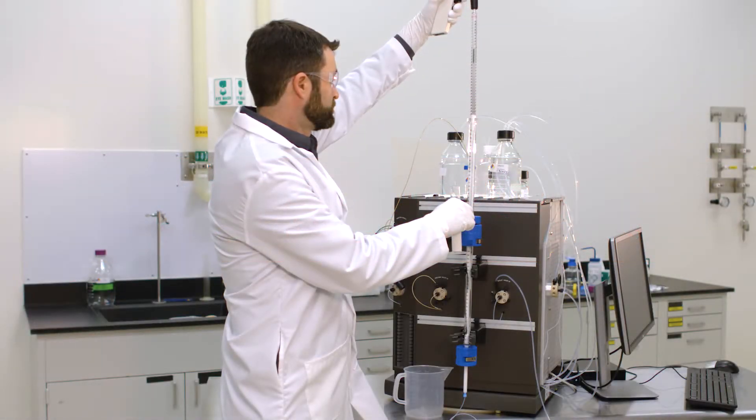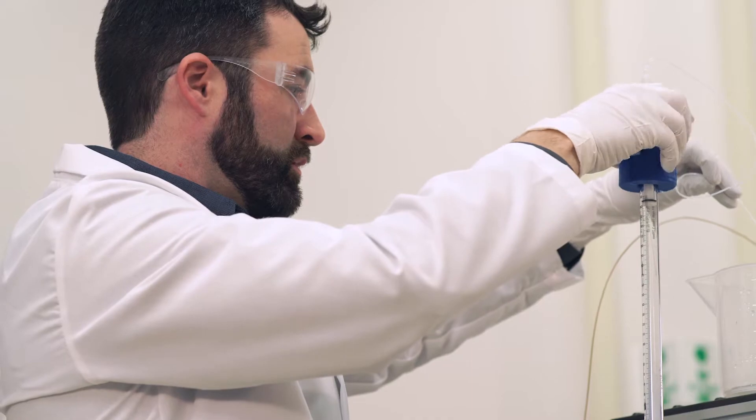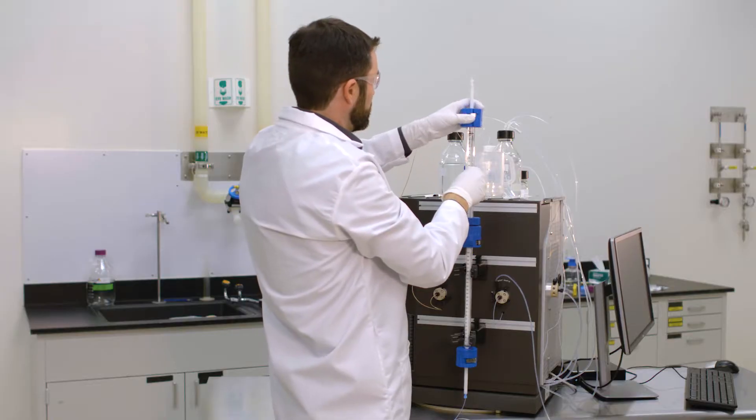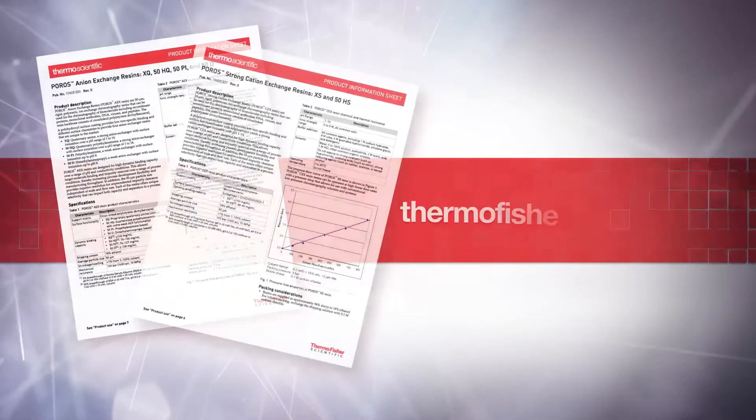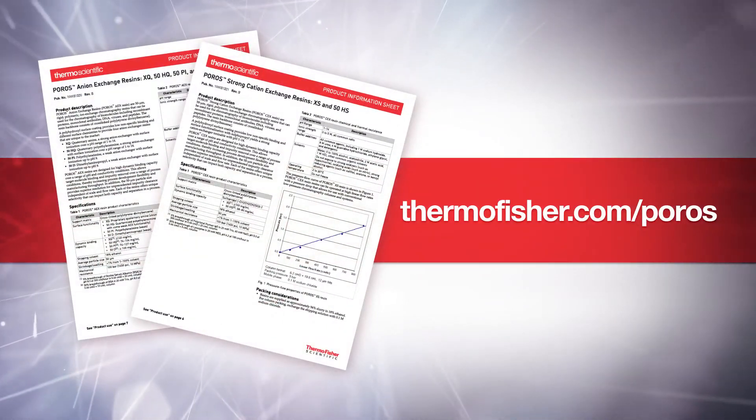This video highlights and expands upon the Thermo Scientific POROS column packing protocols. Please refer to the protocols for detailed instructions. Protocols and other product information can be found at thermofisher.com/poros.